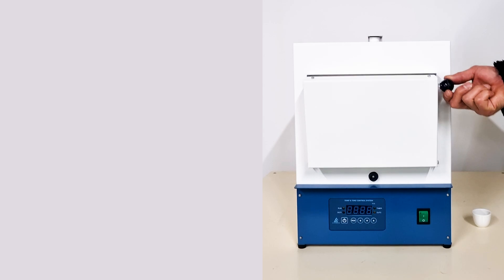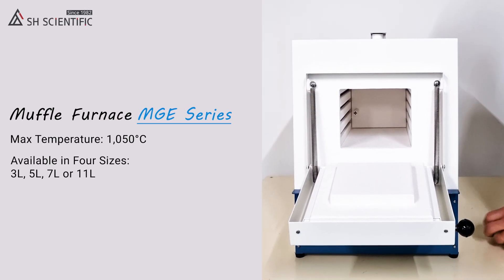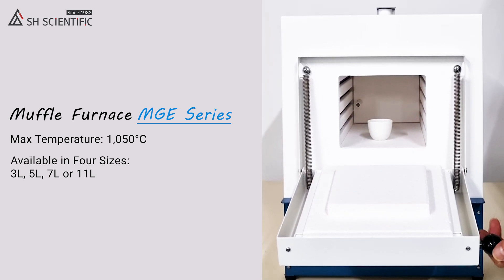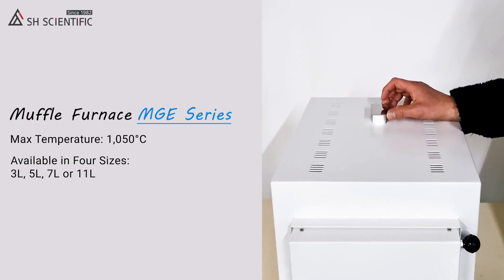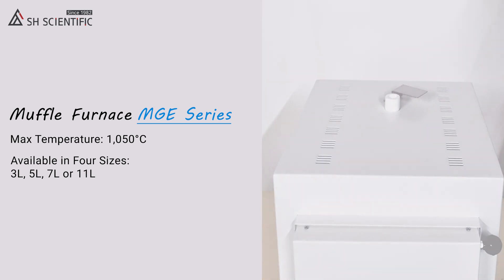To start, simply open the door and place your samples in the chamber. All our Muffle Furnaces have an exhaust port on top, so remember to open it if your sample will produce volatile gases during processing.